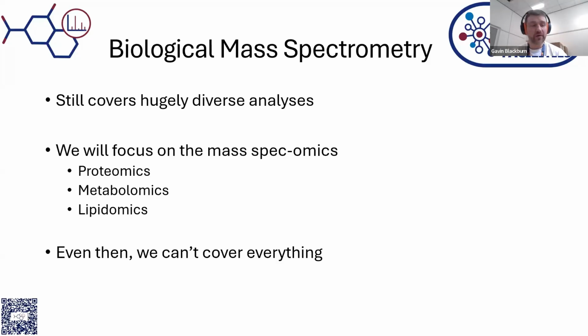We will focus in the end of this discussion, so for the last 5-10 minutes as I flick through things, on proteomics, metabolomics, and lipidomics. And even then, though, we can't cover everything. We can't develop a method that will guarantee covering every single metabolite in a sample. It's just not possible due to that really heterogeneous chemistry that you expect to see within these samples.